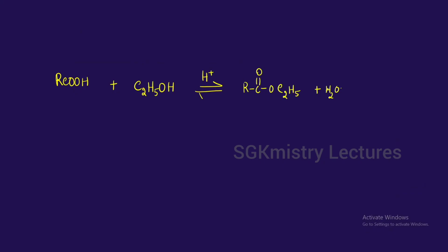After the esterification is done, why do you think you need to add sodium carbonate? So we have seen that the mixture is poured into Na2CO3 solution, right? Sodium carbonate solution. They can ask you this particular question in Viva. So mainly the sodium carbonate is used to remove the excess of sulfuric acid that is added, as well as if there is any unreacted carboxylic acid.